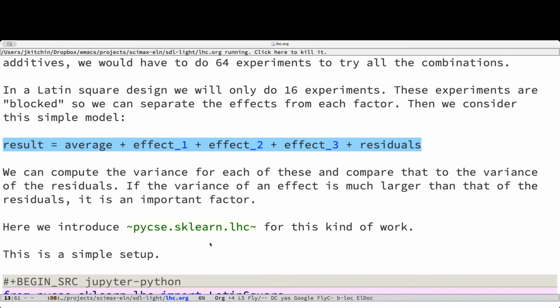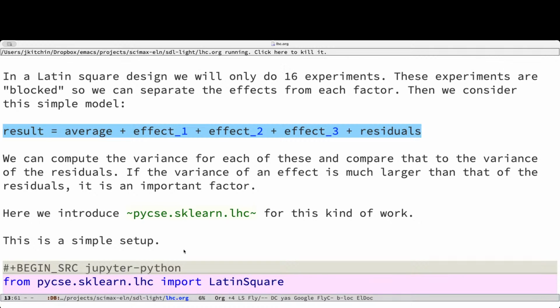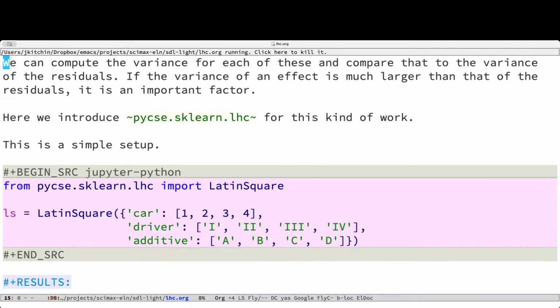It's not a very sophisticated model. It took me a couple of days to work out a full package that I like and can show you the main idea. And I'm going to show you 2 ways to use it today. The first one is in this example here. So this is the setup.